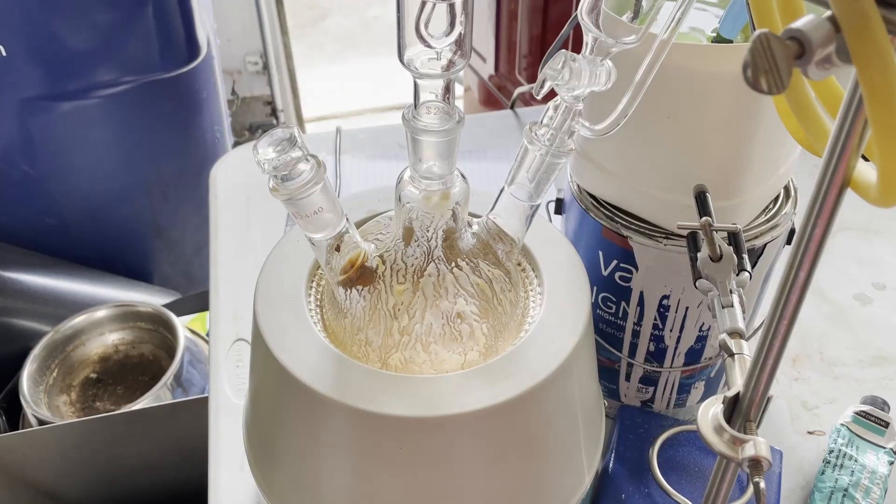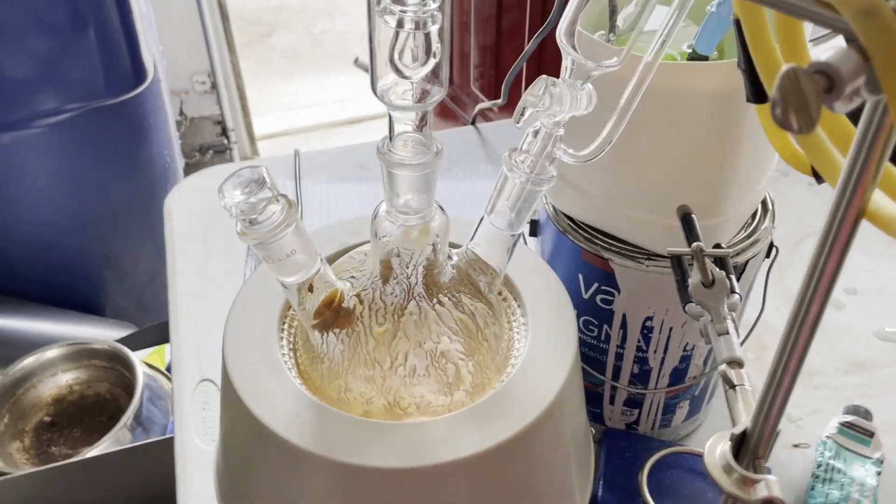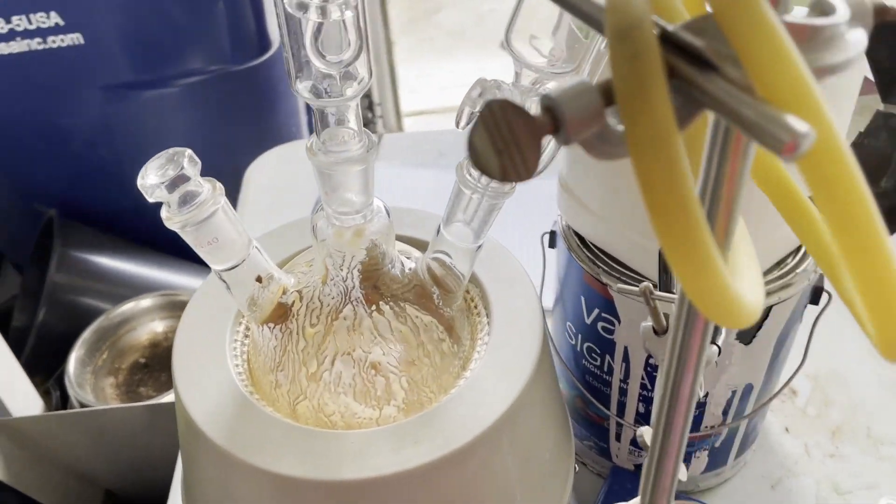At this point, the solution started bumping very violently because my stir bar sucks. But at least the reaction was nearly done, so I could turn off the heat and let it cool down.